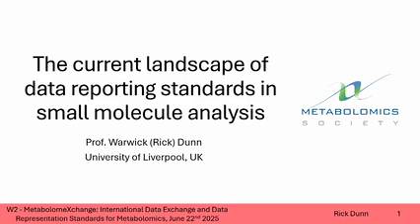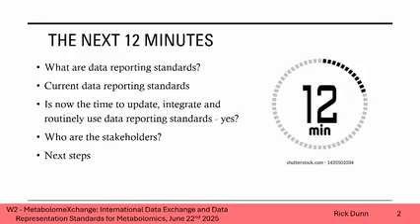So I'm going to talk about what data reporting standards are briefly, what the current data reporting standards are, and there are different types of data reporting standards available, okay? And we're not talking about changing any of these significantly, about removing any of these, coming up with new sets of data reporting standards. It's about what's here and being able to use those that are already available. And then we're going to talk about what we want to do next and who the stakeholders are within that.